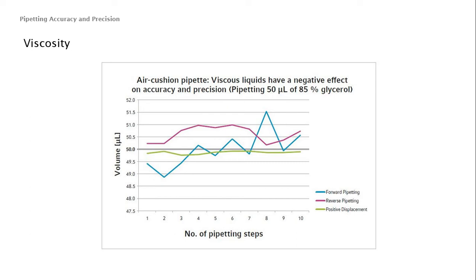You can easily notice that air bubbles are quick to form and liquid residue remains on the inner wall of the tip. The best ways to counteract this are to use slow aspiration and discharge speed, or to use the reverse pipetting technique.